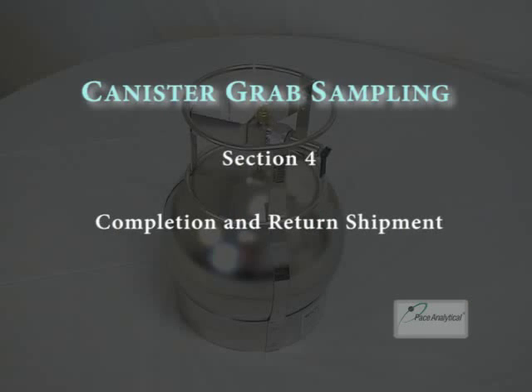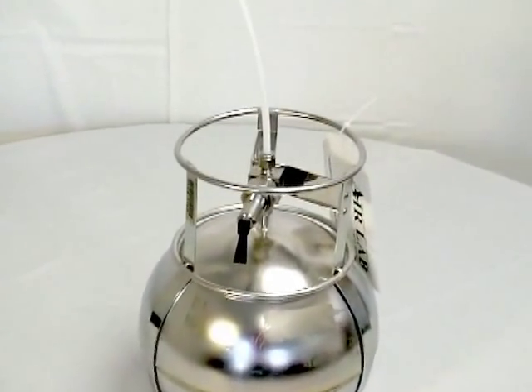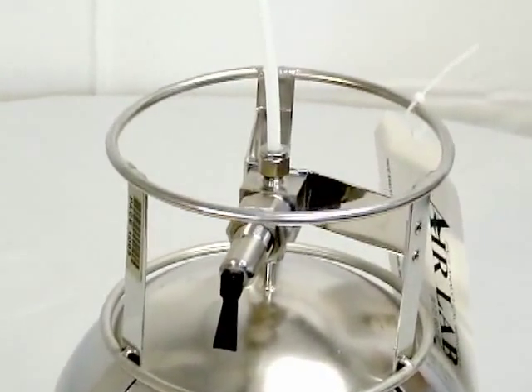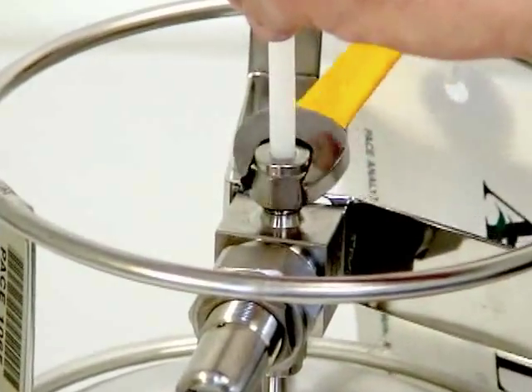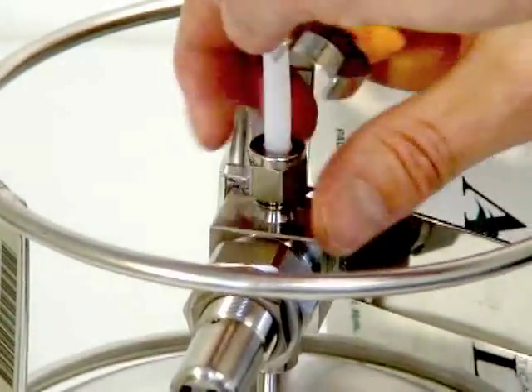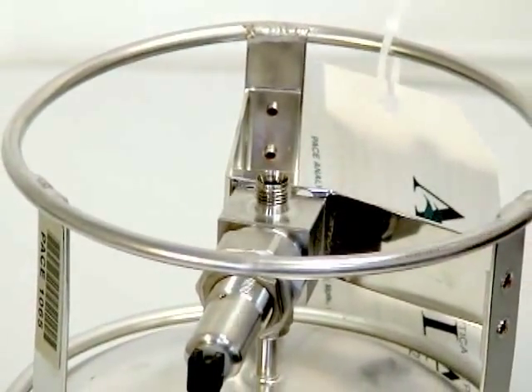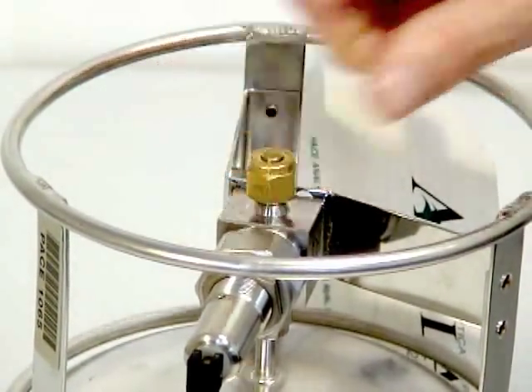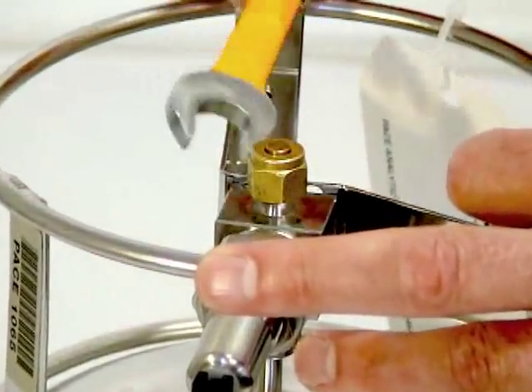Section 4: Completion and return of the shipment. Now that the sampling event is complete, you will need to prepare the parts for return to PACE. Begin by disassembling the parts you had previously connected to the canister. Using your 9/16-inch wrench, loosen the tubing fitting and place the parts into the original bag. You will then replace the brass cap on the sampling valve and use the wrench one last time to tighten the cap into place.